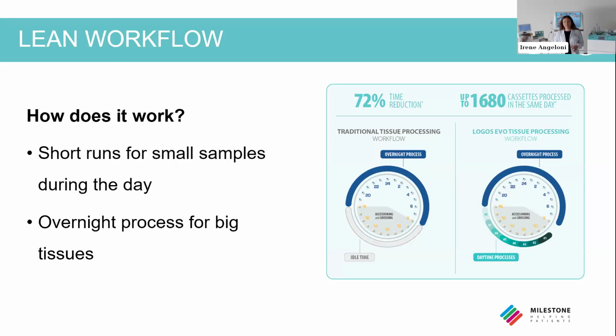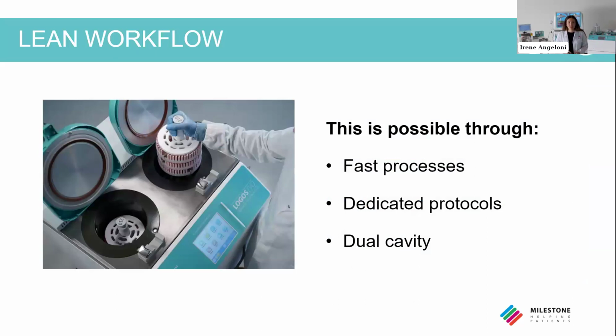So I think that laboratories are trying to introduce this short run during the day because they see the value of starting to divide the samples in a different way. Of course, to do this kind of workflow, I also need a tissue processor that allows me to do fast processes with dedicated protocols for these different kinds of samples, so for the small ones and the biopsies.